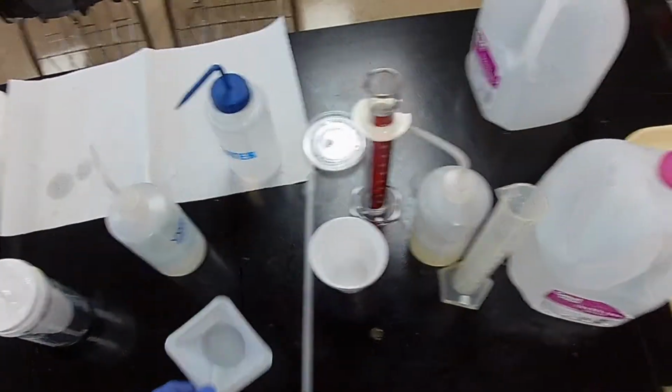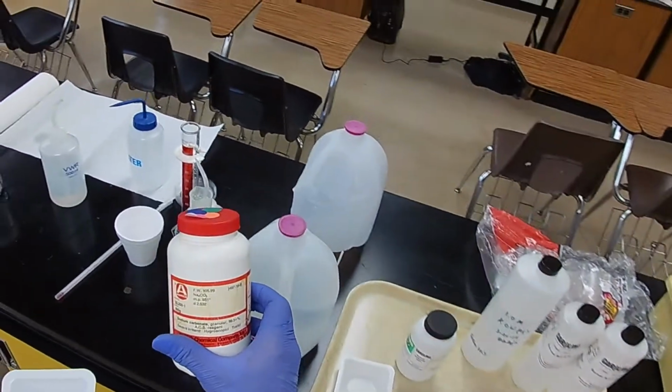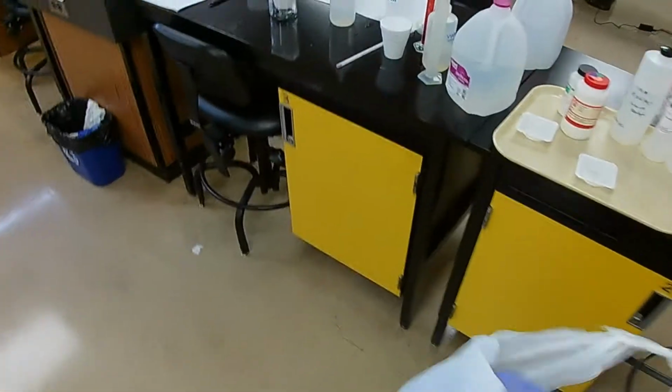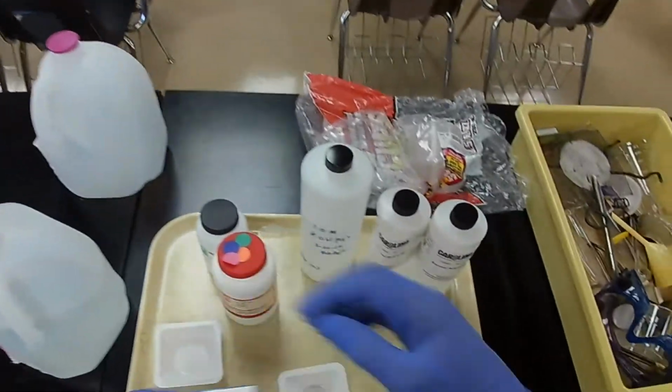This will be our initial temperature again. Now, while we're waiting, let's see. That's been used. We'll clean it later. That's our sodium carbonate. I need sodium bicarbonate. It's always good to double check. Aha! Here it is. Baking soda, which is sodium bicarbonate. Okay, so let's go measure out how much.